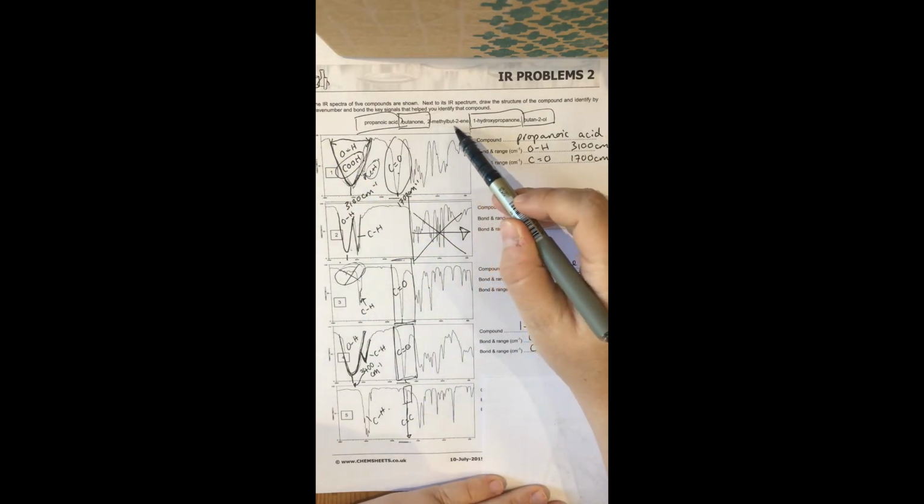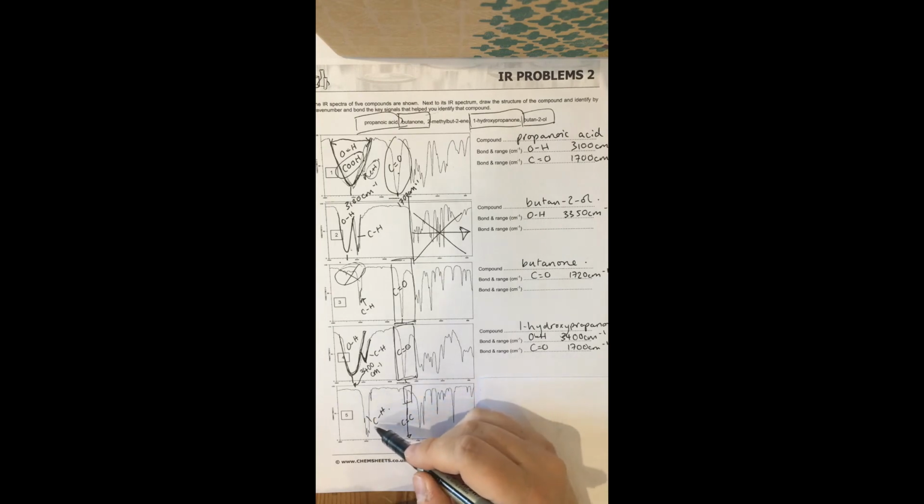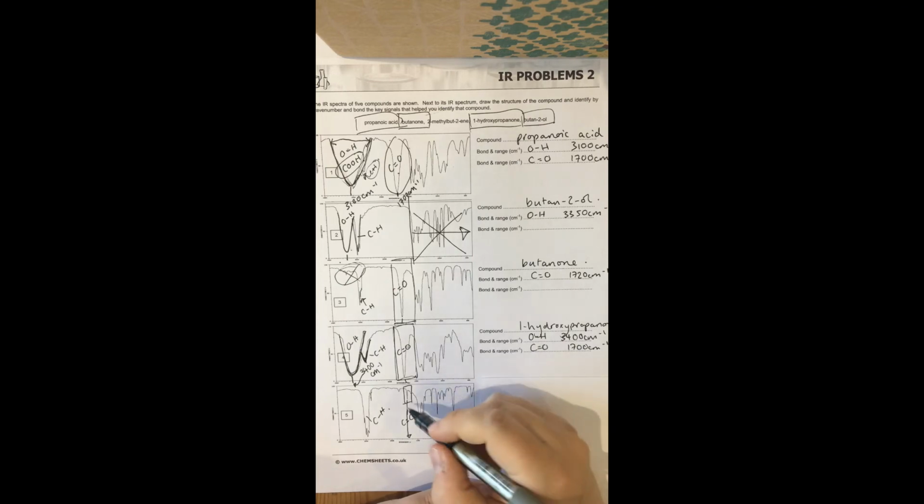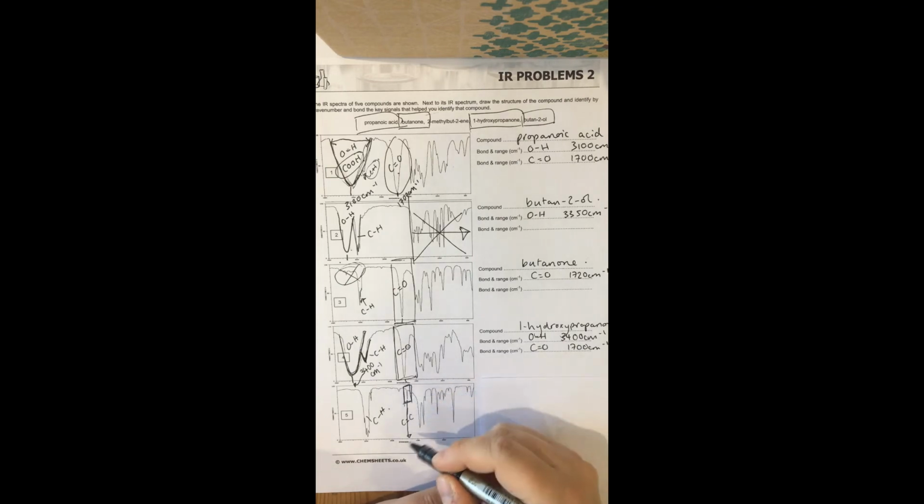The last one, we know what's left. We can see it's 2-methyl-but-2-ene, so it's an alkene. We're only looking for the CC double bond. This peak here is a CH peak. It's really strong, you can see it clearly, but it's not very interesting. What we're looking for is that double bond. It's really small, that one there, which is at around 1680 in this one. It's really difficult to see, so you'd probably miss it unless you knew you were looking for it, which luckily in this case we do. So that's 2-methyl-but-2-ene.